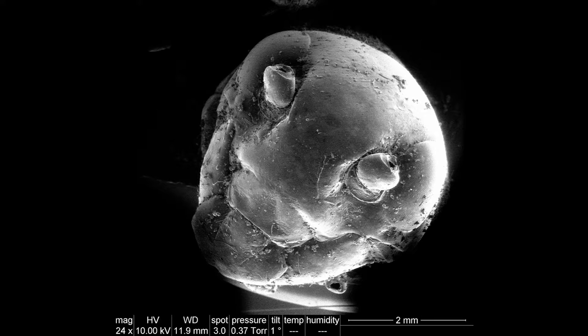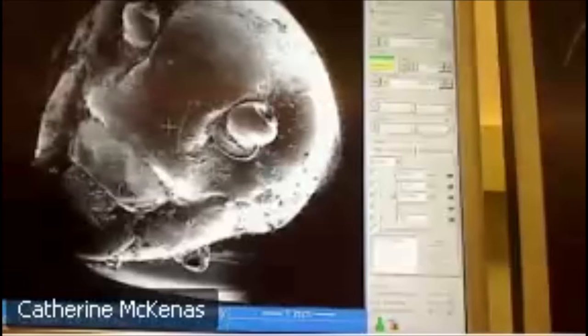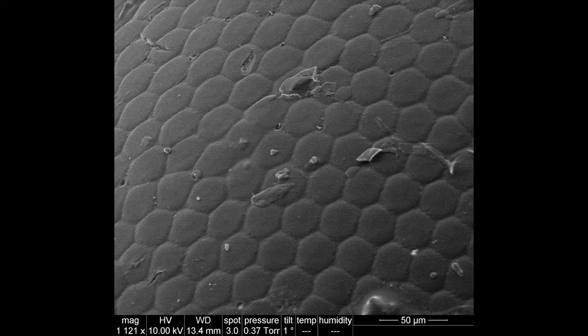Crickets usually have three eyes, and unfortunately we couldn't find the third one, but what we're zooming in on now is kind of like their main eye. What you'll see is very hexagonal shapes here on the eye. Are y'all able to see that okay? Yes. Okay. These are actually hexagonal lenses, and these lenses allow a cricket to see all around them. They don't really have to move their head around to see. They can see all around them at one time. We're taking a picture of that for you guys. You can see that this structure is very symmetric. There's a couple of debris, just like dirt on him, but the structure of the lens is really nice.